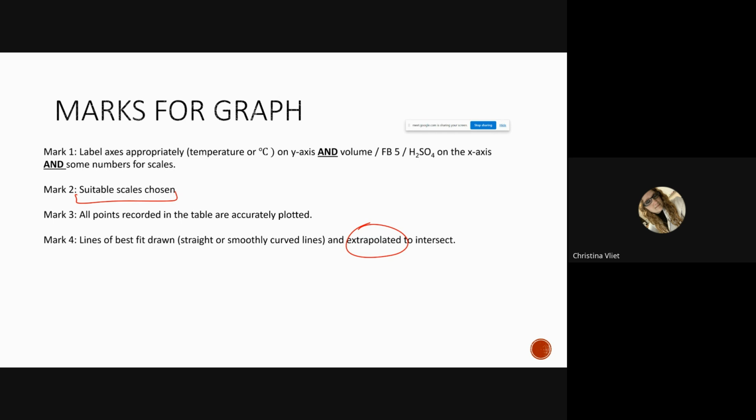That's your reaction actually. And then heat retains at the same time. And so I would say there's probably a decent amount of error in the experiment. And that's okay. You should check that. That's part of the experimental design stuff. But yeah, I would expect the error could be higher.